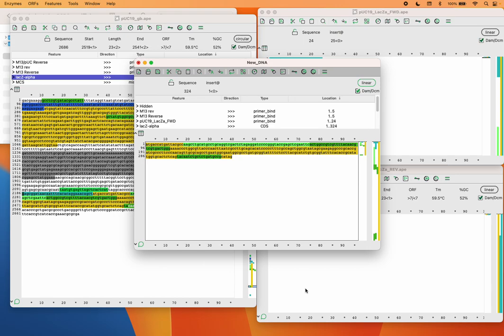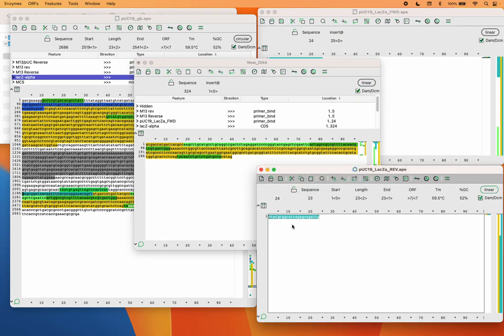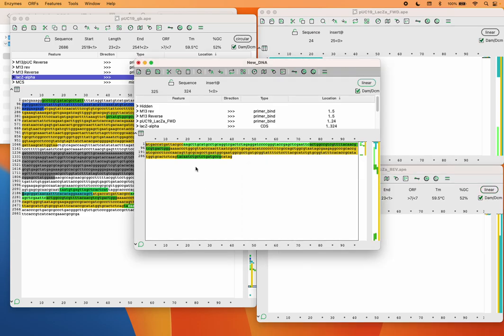If you had chosen the wrong pairs, and let's say you forgot to do the reverse complement of the reverse primer, it would not spit out any sort of sequence, and you would know that something had gone wrong. So this is the beauty of APE and doing these in silico experiments, is they help to do a kind of checkpoint to make sure you're doing things right.